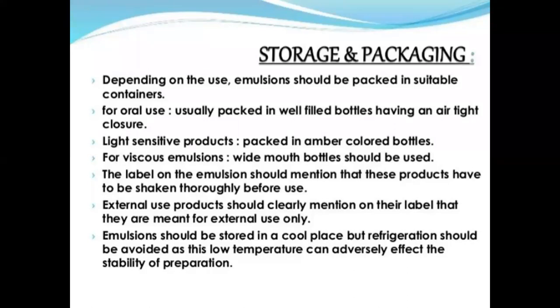Did you write the instruction on the label with a red pen? Then the label on the emulsion should mention that this product has to be shaken thoroughly before use, meaning shake well before use. These instructions should be written on your label.